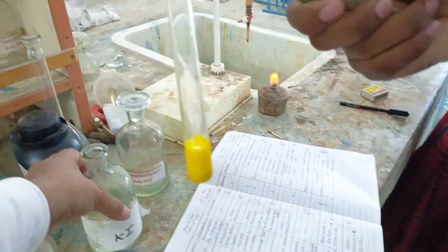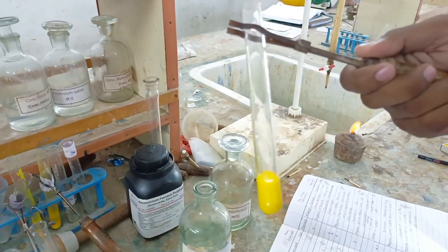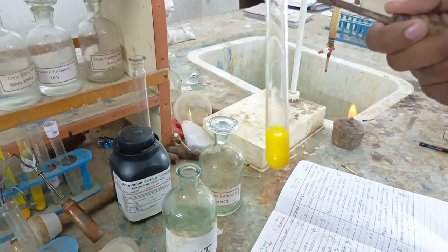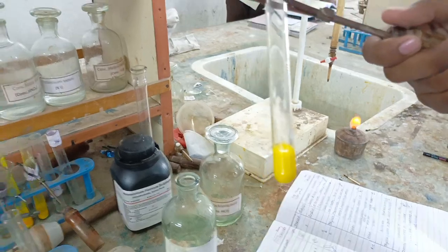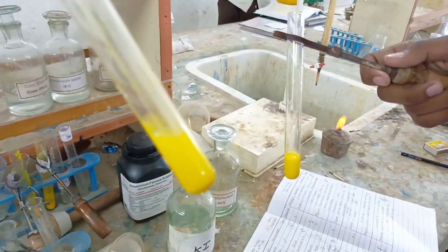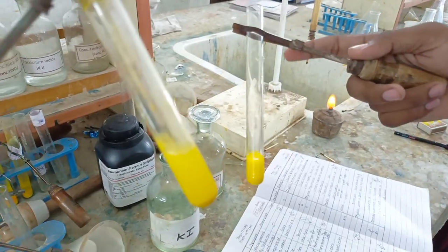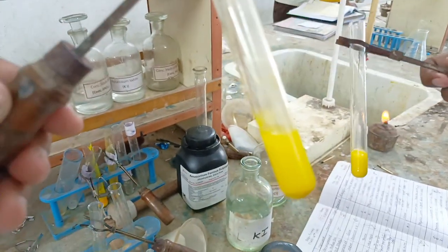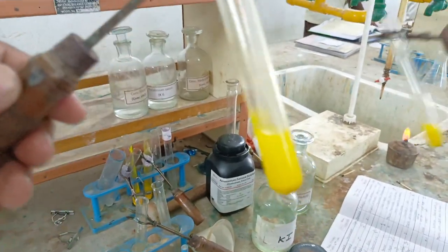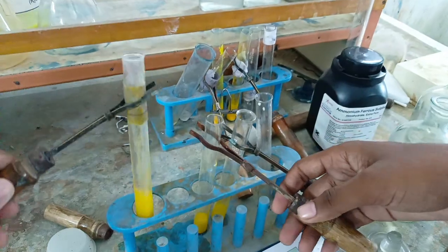You can see in the dissolved precipitate, after adding the potassium iodide, yellow precipitate will form. Similarly, in the dissolved precipitate, when we add the potassium chromate, again yellow precipitate will form. So we can confirm the lead ions by the potassium chromate and potassium iodide test. Thank you.